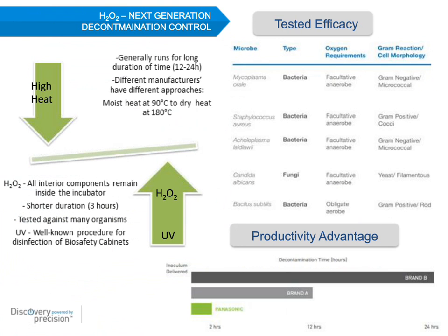That's become a demand in the market. Now when someone's buying a new CO2 incubator or outfitting a lab, they really stress the importance of contamination control. And that's been done in a number of ways. A popular method is to do a high heat cycle within your incubator: take all of your cells and cultures out and ramp up your incubator to extreme heat to denature any cells or contaminants in there.